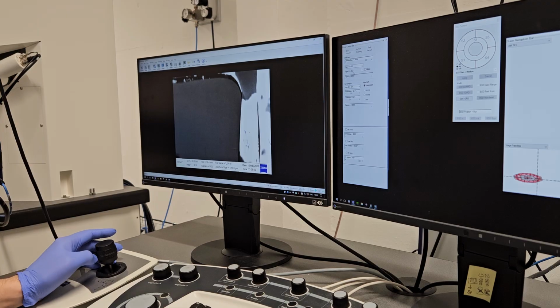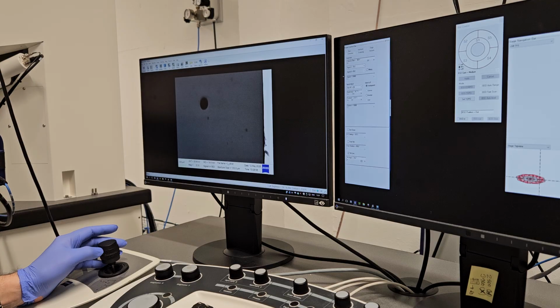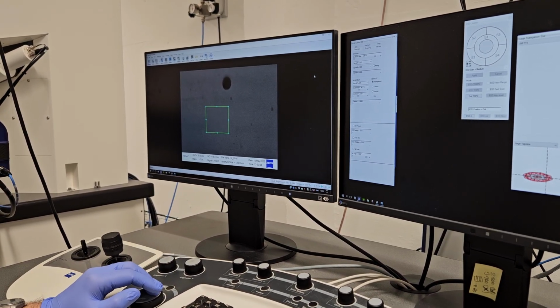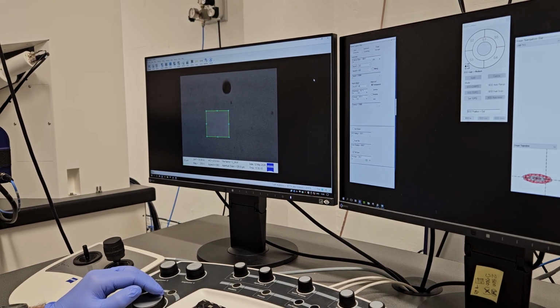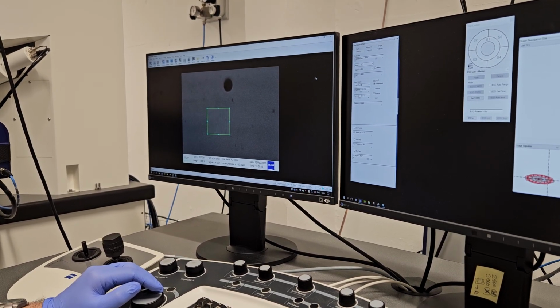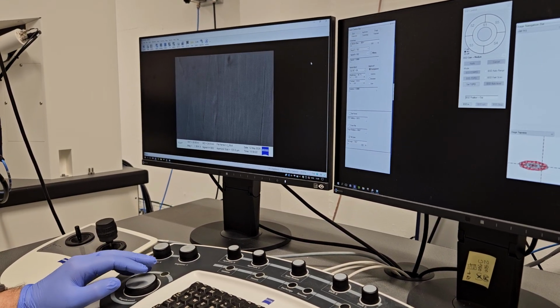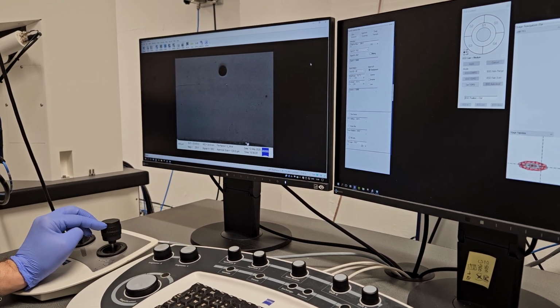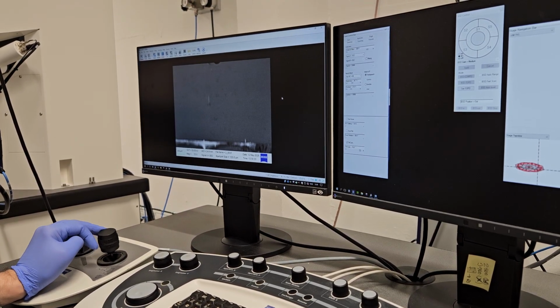Okay, this is the second one. They both have holes. Okay, so maybe this is the second one. This one is more than the second one, is it? They are colored at the same time, because they are embedded together, correct? I don't know the history. I just see that the quality is bad. Equally bad. Yes, this was sample one.